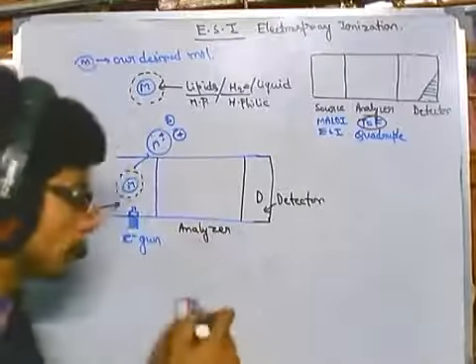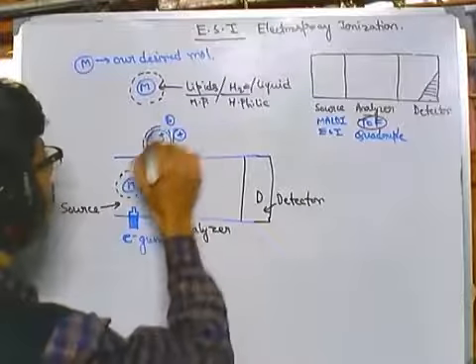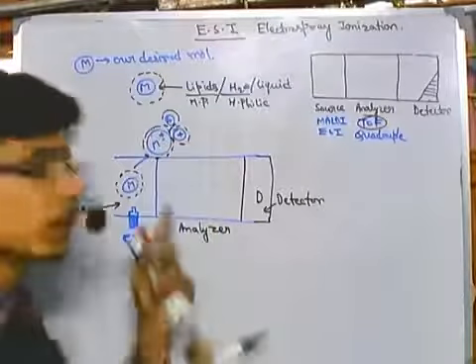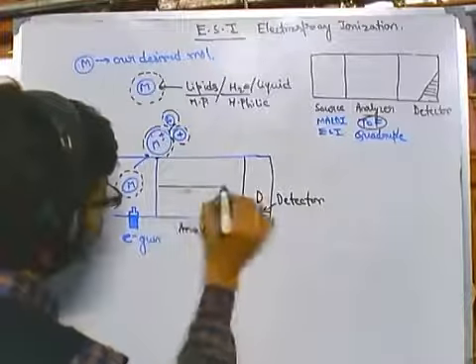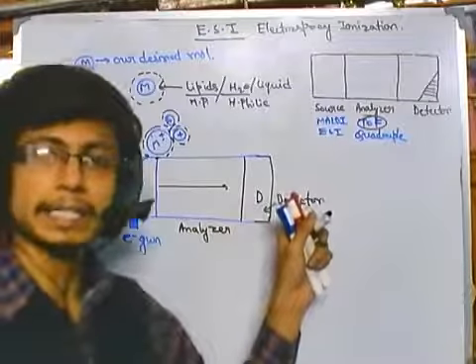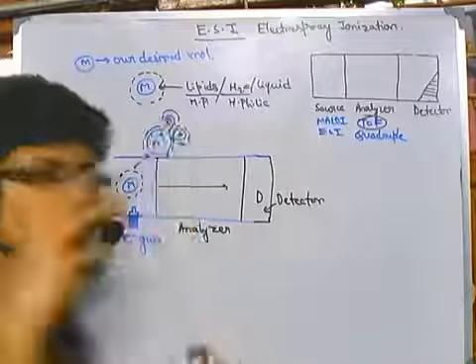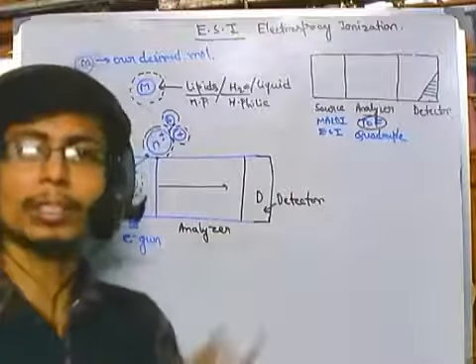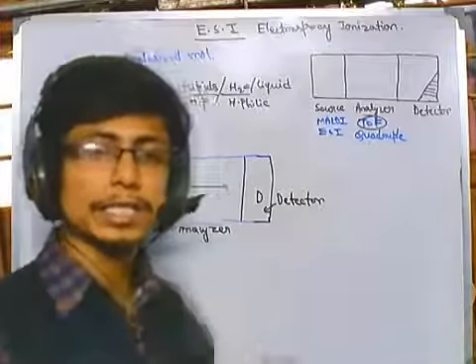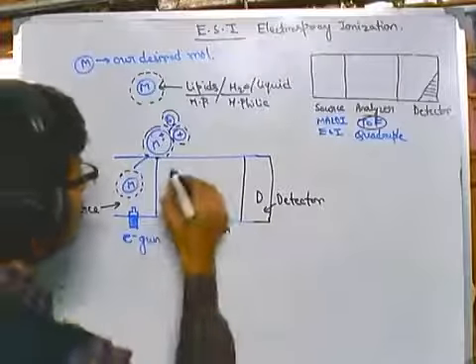Whatever particles are produced remain in different clusters. All of these particles will be coated with these micro droplets, so they are forming micro droplets. Now these micro droplets will move through the analyzer until they hit the detector, right? If this droplet hits the detector, the detector cannot detect anything because it is already coated by other molecules. So we need to get rid of these liquid parts. For that, in this analyzer section there are some modifications, like we put different barriers, different chambers.